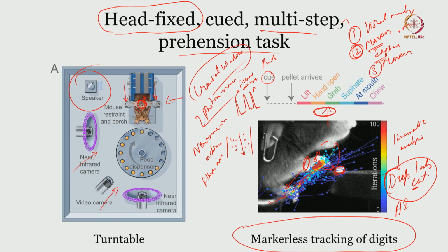So, these are the 3 different levels of sophistication. If one asks which one we should prefer, I would obviously say the third, which is most sophisticated, not just because there are no markers which can introduce errors, but also because it is easier to analyze and more objective compared to visual analysis of your videos.